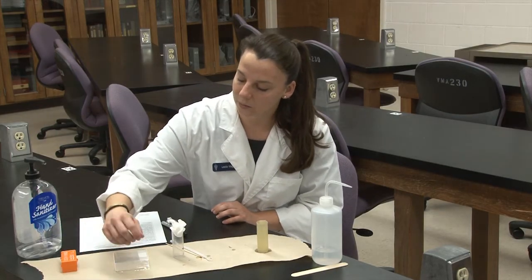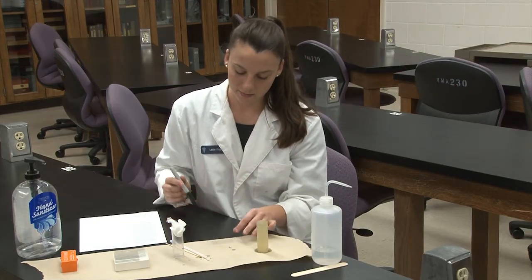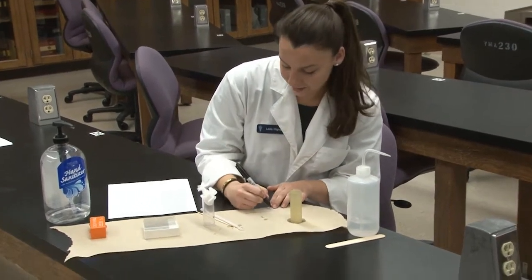While we're waiting on that, we'll take a fresh glass slide and we're going to label it with our patient's name. Today it was Z.